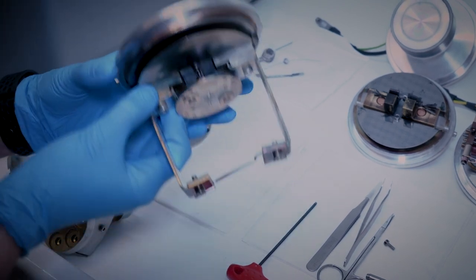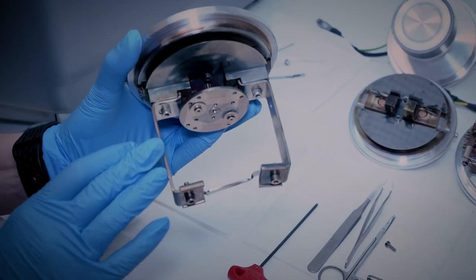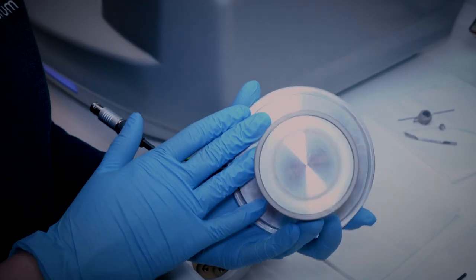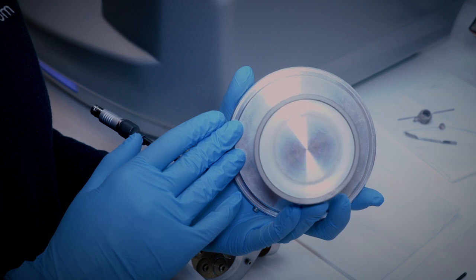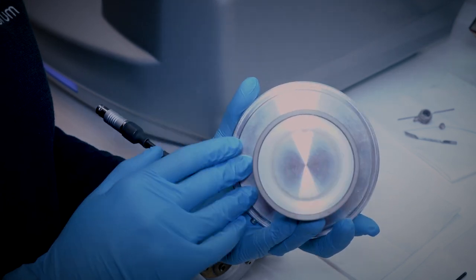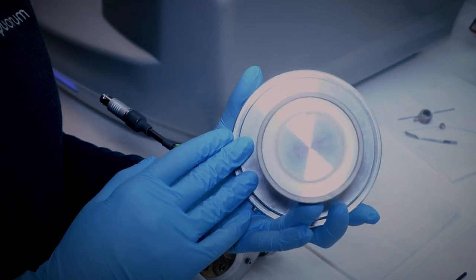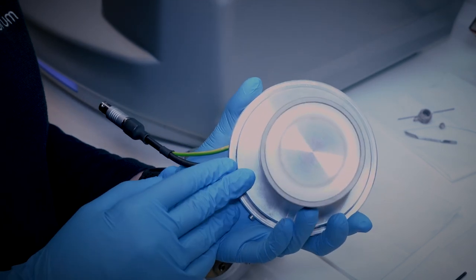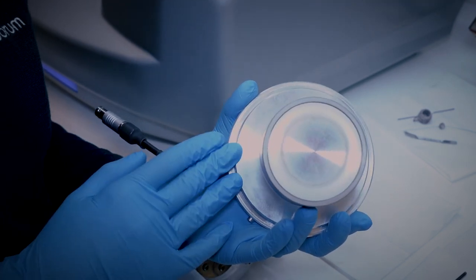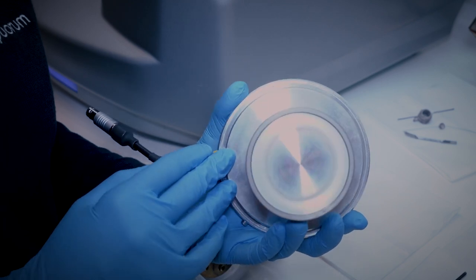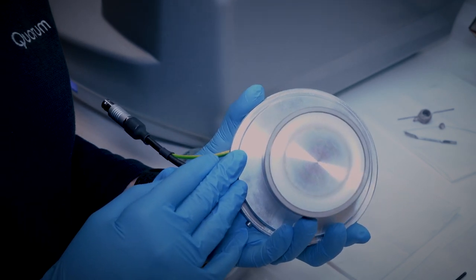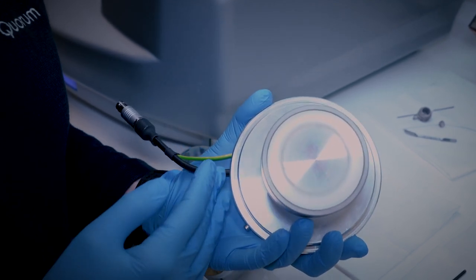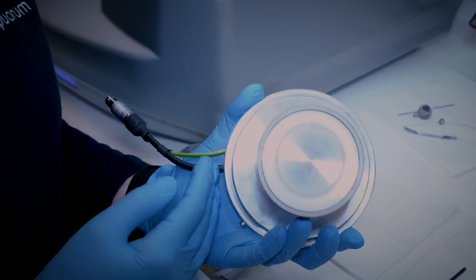So this head is for thermal evaporation of metals and it works really nice. This is our last head, this is plasma cleaning and glow discharge head with which you can either etch surfaces or glow discharge and this process is for making surfaces clean and hydrophilic.